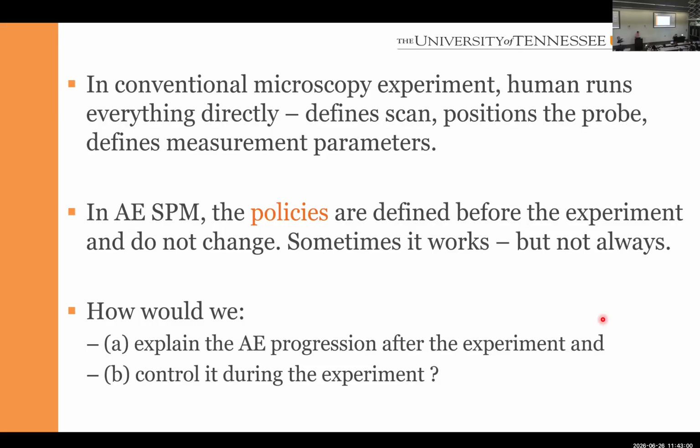The typical experimental campaign that we run now on the SPM is somewhere between 10-20 hours. So imagine that it was your job sitting in front of the microscope and doing the same type of things. We would be happy to do the same thing for the electron microscope, but we have to pay a lot for the time, and it's faster, so we can run the experiments considerably faster than that.